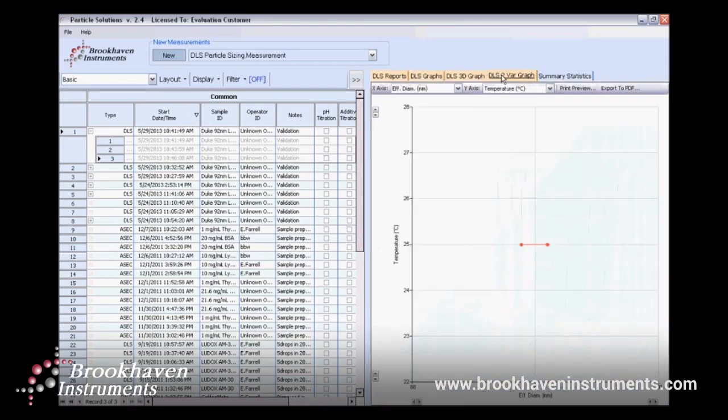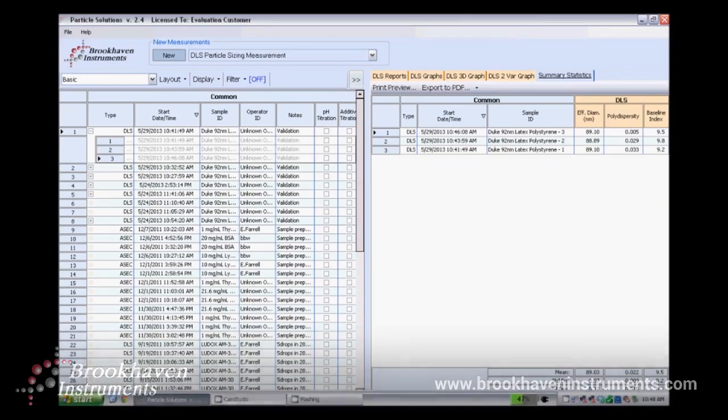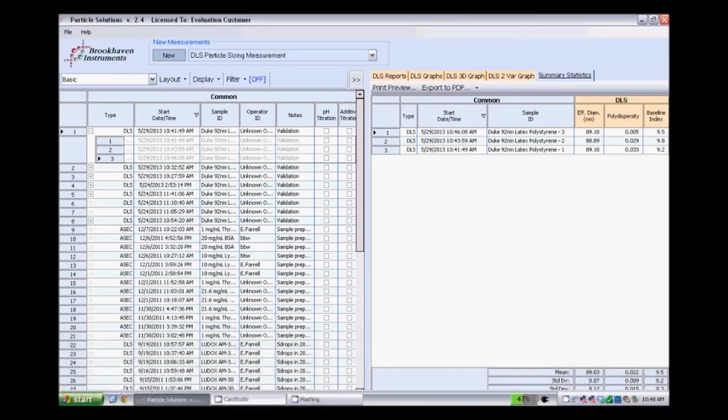As you can see, the effective diameter and polydispersity are all within acceptable ranges. Thank you for your time and I hope you found this video helpful.